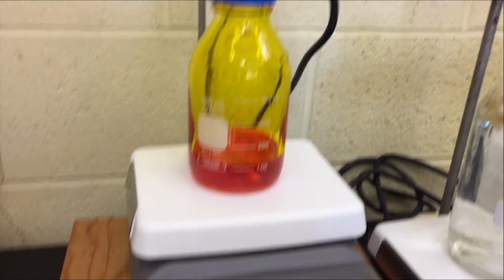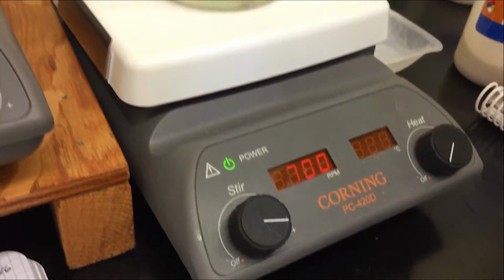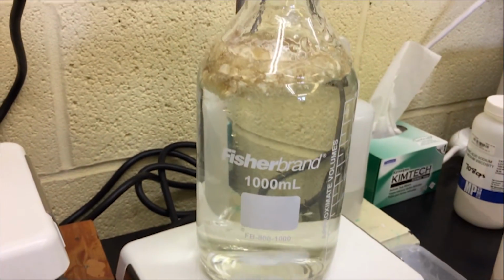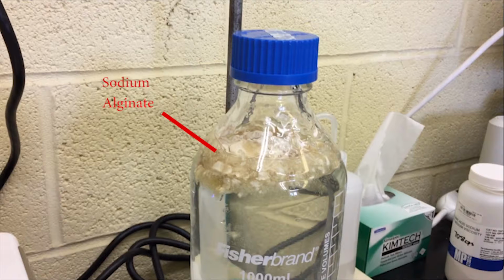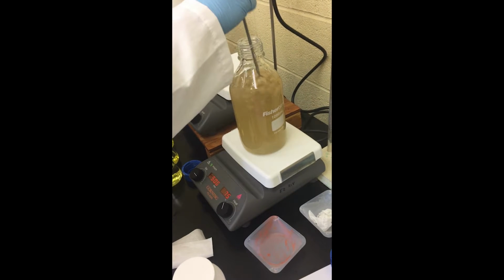Once the proper amounts of each solute were added to deionized water, each solution was left on a stir plate to mix until a homogeneous solution was created. For the sodium alginate solution, it was noted that homogeneity was not achieved for at least 24 hours, and that manual mixing was needed early on in the process.